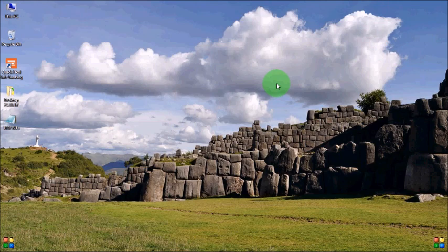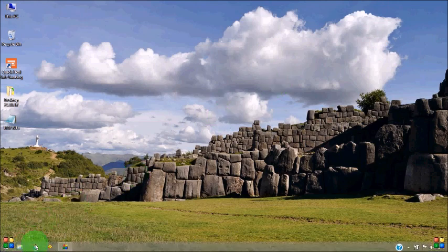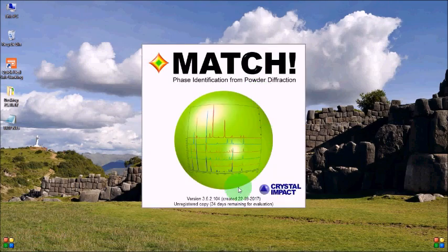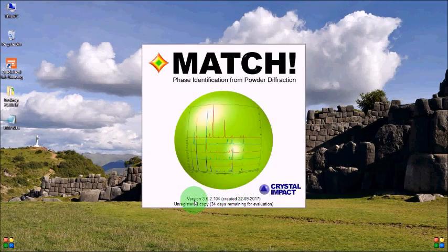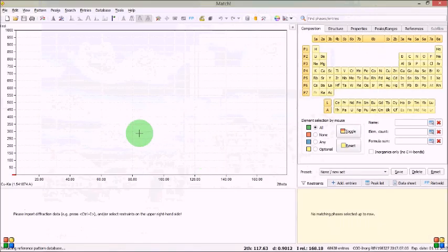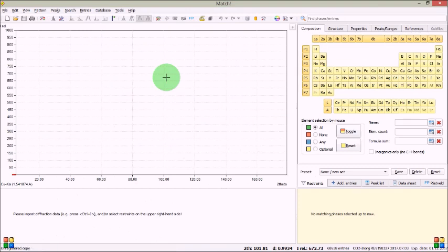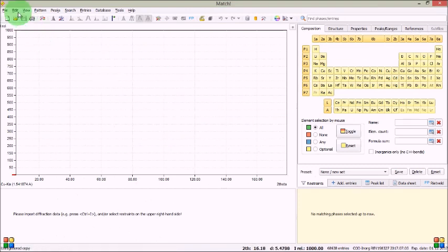I have got the MATCH software trial version and I shall use this one. You can see this is trial version and I shall use this software to explore something to analyze my XRD data. So let's start.